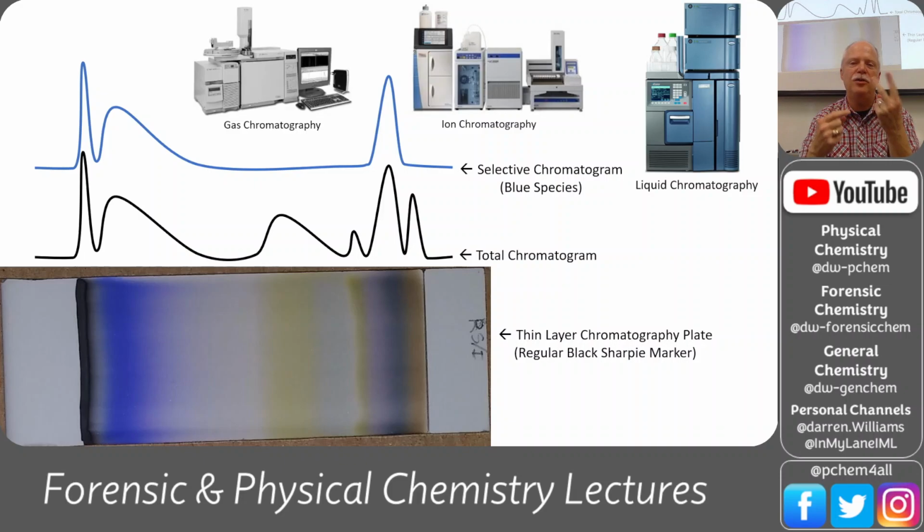And so you're getting 2 analyses out of a hyphenated technique, like a gas chromatograph and a mass spec. There's lots of detectors you can put on a chromatograph. A lot of them are like thermal conductivity detectors. They don't really give you anything tied to the identity of that compound. It's just how that compound affects the heat that's coming off of a little hot electrical wire. The conductivity through that electrical wire will change depending upon the gases that are around it.